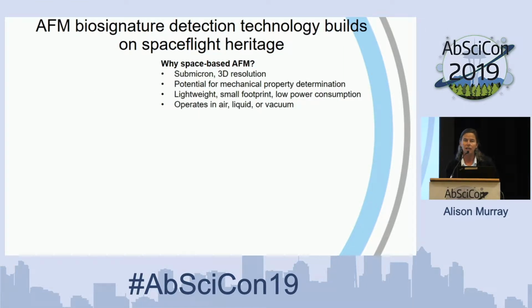So AFM biosignature detection technology, as we have thought about it, builds on spaceflight heritage. There are a number of assets to using AFM in space, in addition to its submicron 3D resolution and the potential for nanomechanical property determinations. These instruments are lightweight, they have a small footprint, and low power consumption. They can operate in air, liquid, and in vacuum.